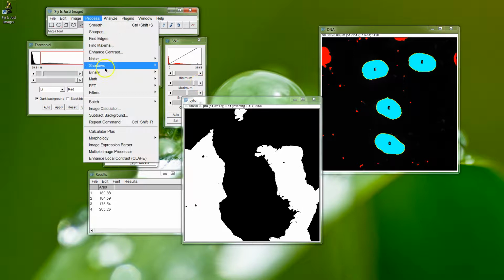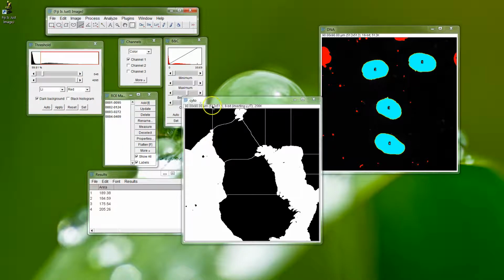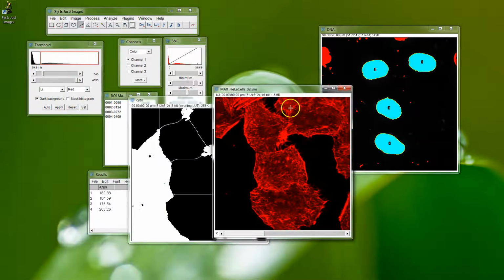So now what we're going to do is go to this binary method again, and we're going to do watershed. So it's going to go across and try and create channels as if you're filling up the data set with water, and where it would cross over. So it's going to create a channel where it starts to find a crossover between the two. And that's what you would use to separate the regions. It's done really well for this section of 3 here down the middle. Excuse me. And it's not done so well on the outside here. Let's get our image back here.